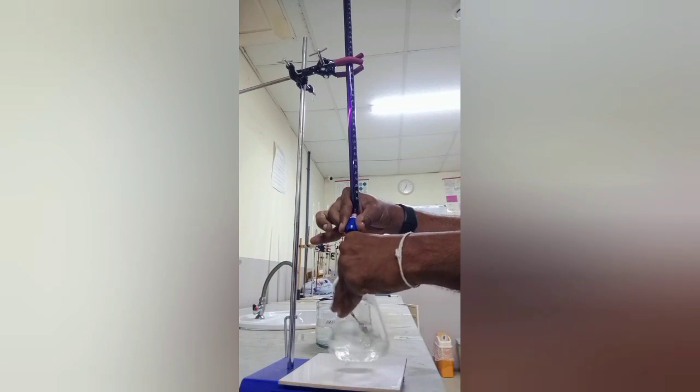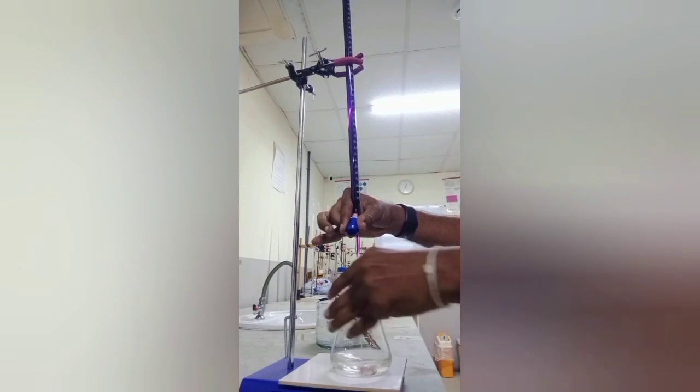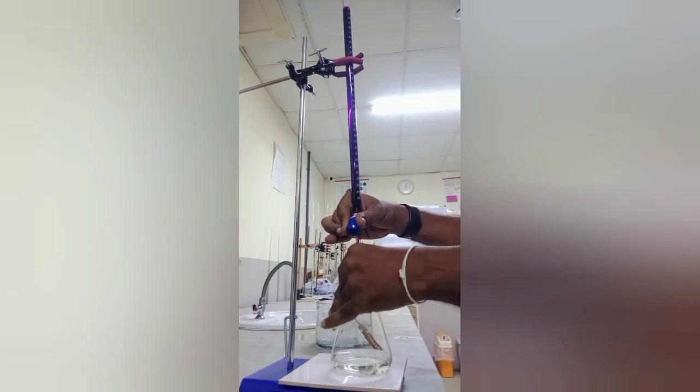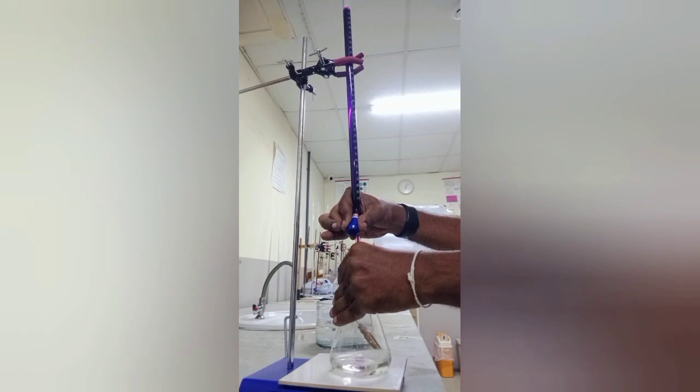You can use the white tile. Ensure that you have a white tile. It helps to identify the endpoint, the appearance of the pale permanent pink color, very easily. When you're doing the titration, check that all the drops are going into the center of the conical flask. They should not go on the sides of the conical flask.